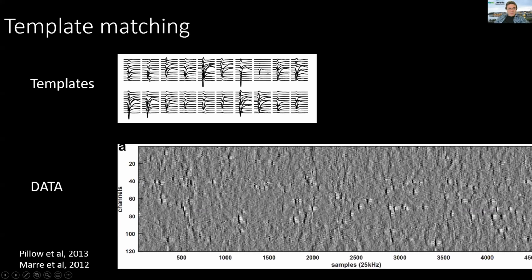You can see most of these neurons have one or a few big deflections where their main spikes are, but they also decay away from that big deflection. That entire spatiotemporal pattern of voltage is useful information. It's something that the spike creates every time it fires. And so we want to integrate that information and build a good detector based on these templates, assuming we already know what the templates are.